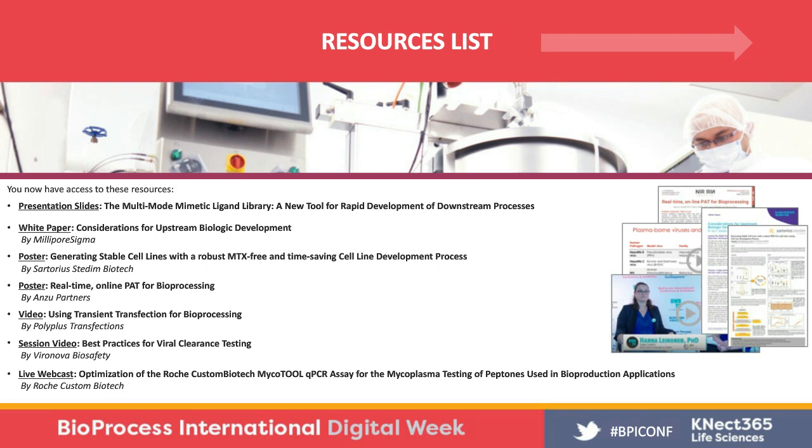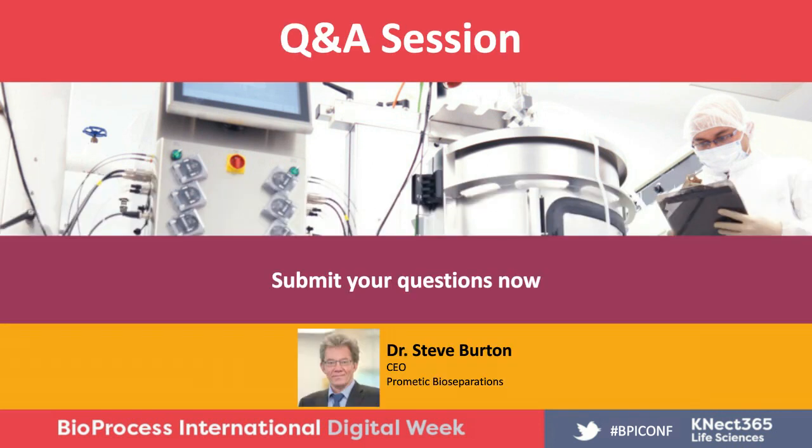So, Steve, we have a question here. Do you have a ligand or ligands which specifically remove or reduce CHO-HCP in a flow-through mode for MAB or FC fusion protein products? Yes, one of the examples I showed there was exactly that.